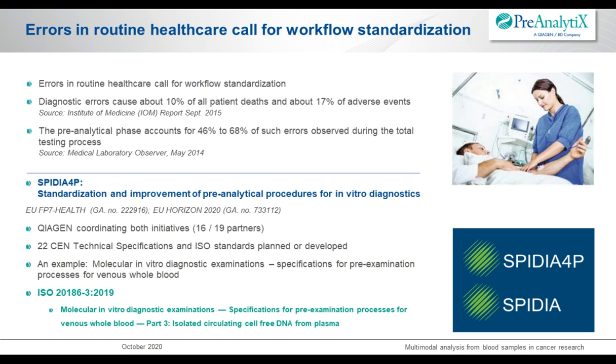So what I showed you here is an example that we need some stabilization and we need some standardization to prevent errors that can be made when you work with ccfDNA.